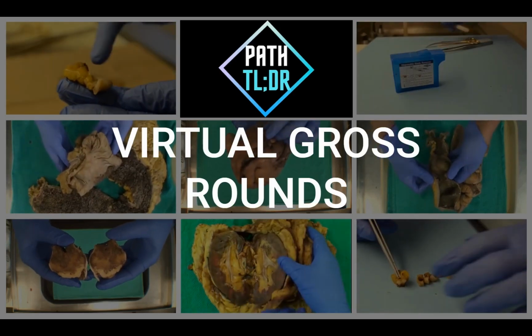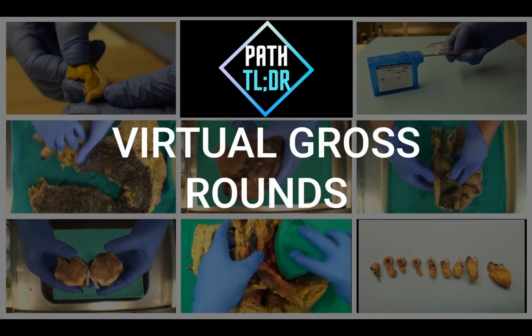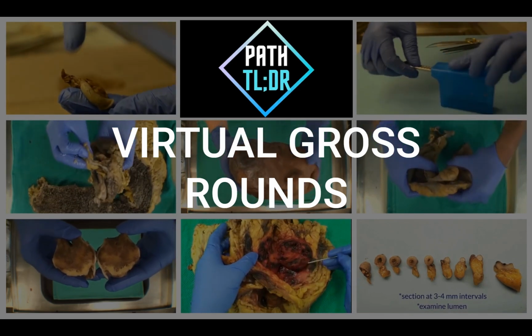Today, we will be talking about a hysterectomy specimen for a cervical carcinoma and an incidental submucosal leiomyoma.